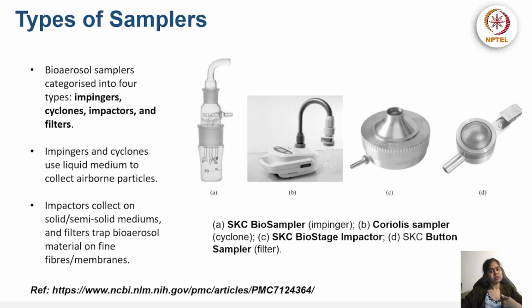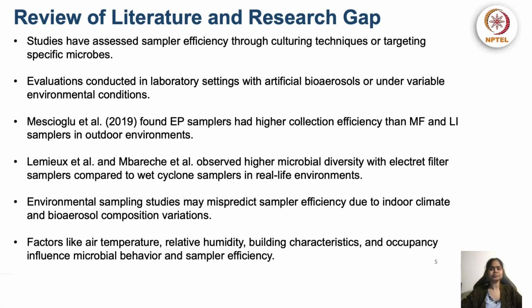If you want to have a long size spectrum, we can go with PM 10. Or if we are majorly looking for a smaller size, then we can go for PM 2.5. So these are some of the samplers that are widely used in the market. When we look into the literature, there are a lot of studies that focus on biosampler efficiency. Why? Because, as I mentioned earlier, there is no standard protocol for bioaerosol sampling, and there is no standard analytical method. So there are many studies which involve understanding how this sampler works in different environments.